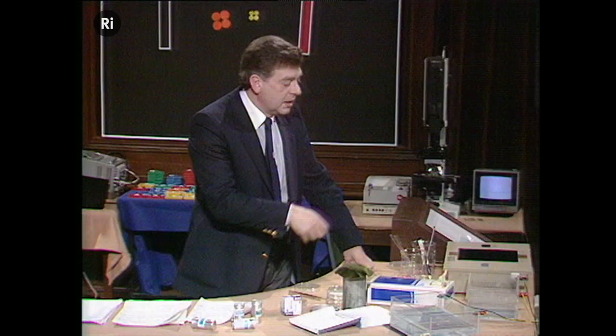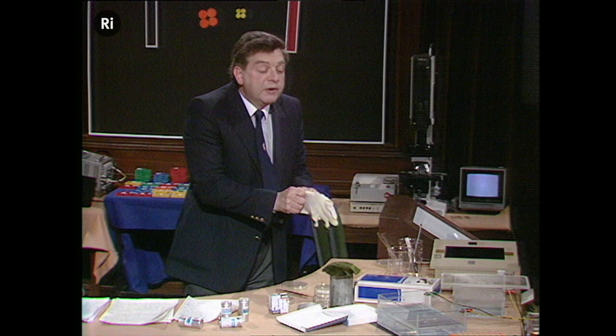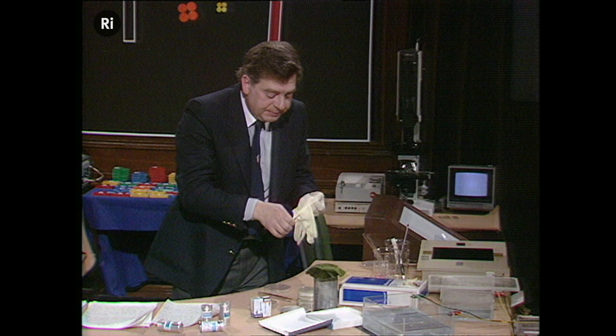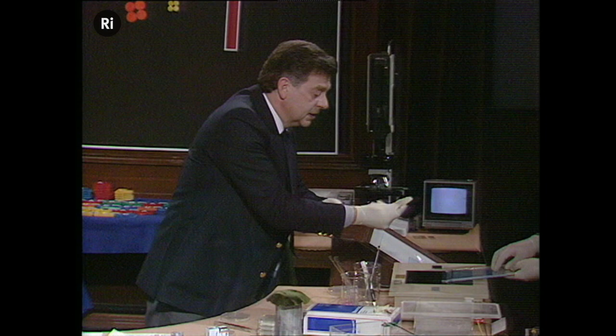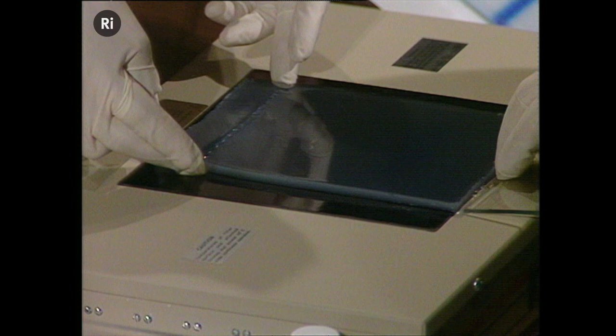So we're going to show you a picture of such an experiment in which we've cut a DNA molecule into several pieces, and then we've separated the pieces according to size using this technique. I'm putting these gloves on because we've stained the DNA with a chemical stain, and we've got to be careful when handling this. And that's why Nigel and I are wearing these gloves. And we're sliding this onto a UV light, a source of UV.